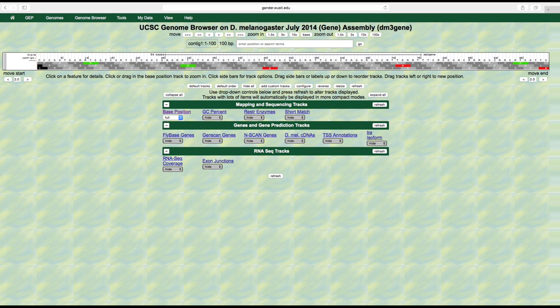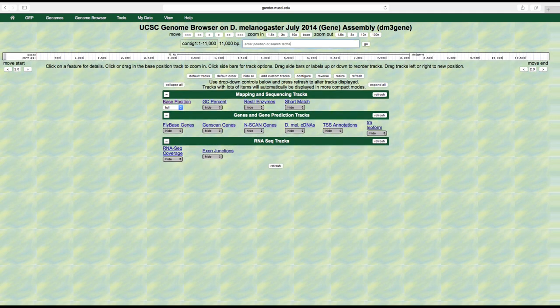Let's look at another feature — the genes that are located in this region of the genome. Let's zoom out to view the entire region by typing in contig 1 colon 1 through 11,000 in the position slash search box. Notice that we no longer see the bases or amino acids — there is not enough room to draw all the nucleotides and amino acids.